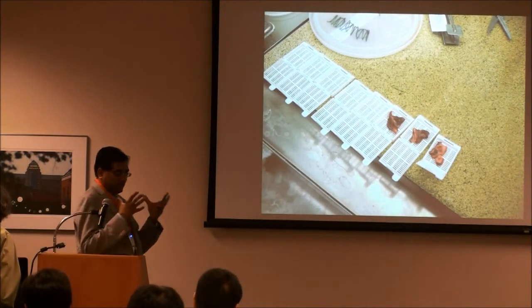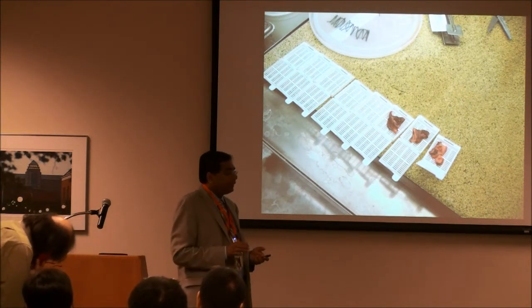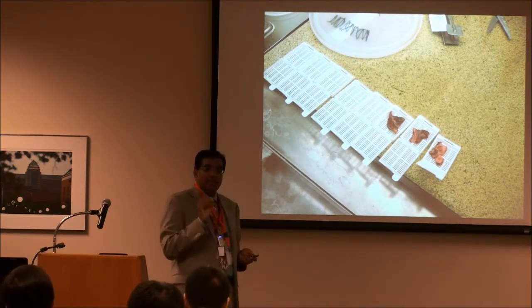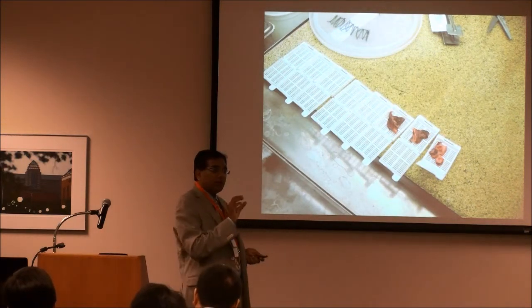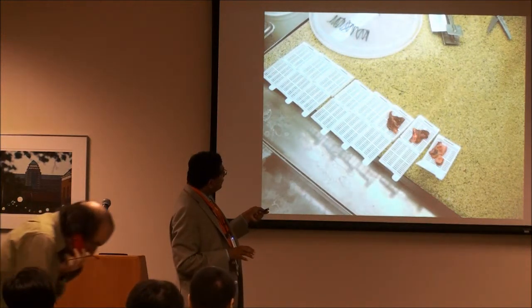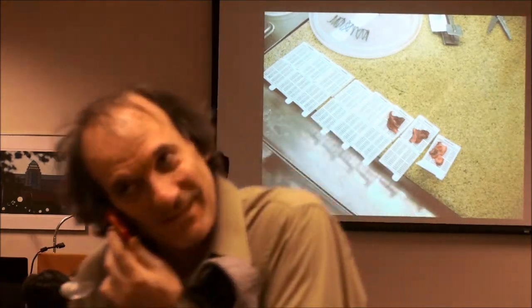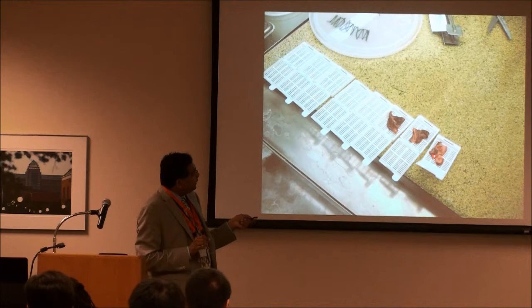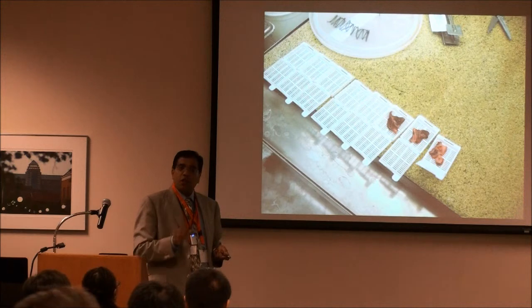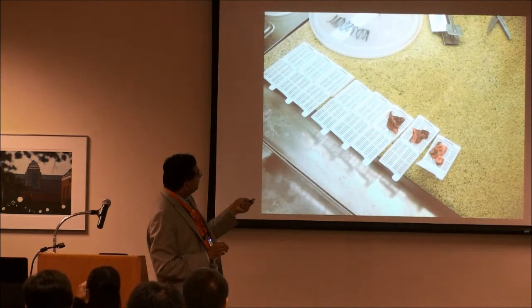After we get the specimen, we open it up or cut it up in a systematic fashion according to certain protocols. We take specific tissues where we think the diagnostic material or diagnostic areas are. We put a little bit of tissue in these white containers called cassettes. And these tissue pieces are called sections. So I put sections of the representative areas of pathology in cassettes.